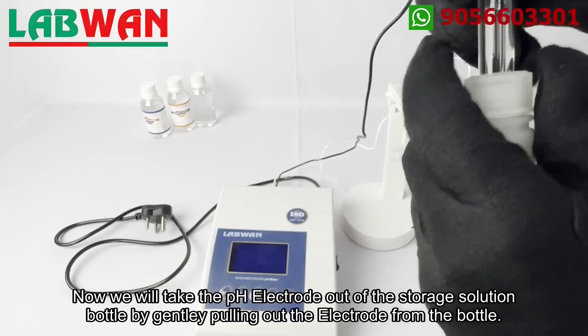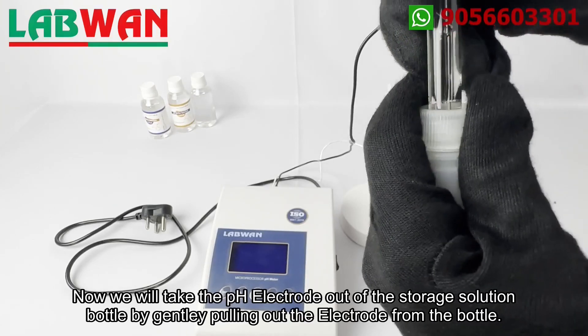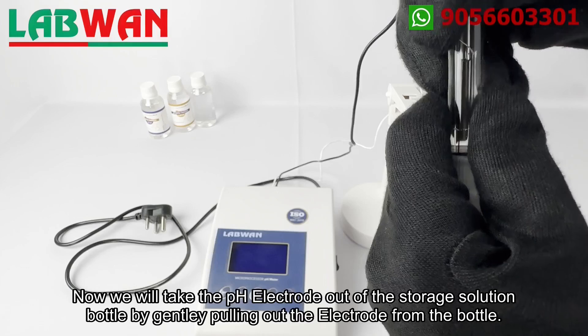Now we will take the pH electrode out of the storage solution bottle by gently pulling out the electrode from the bottle.